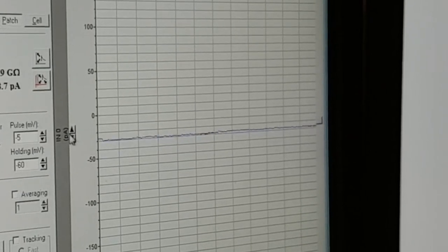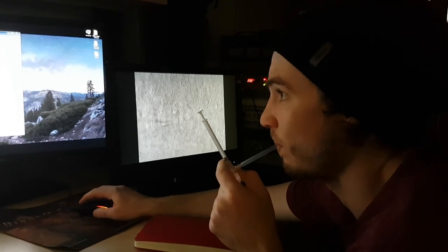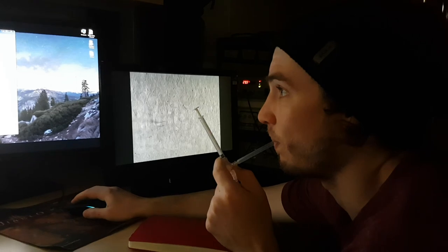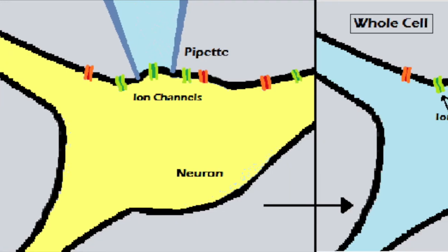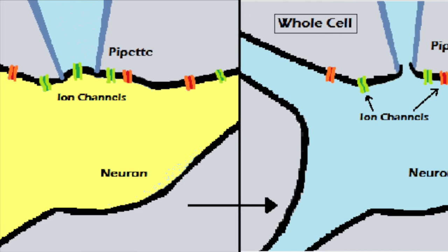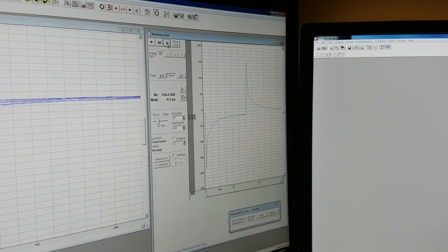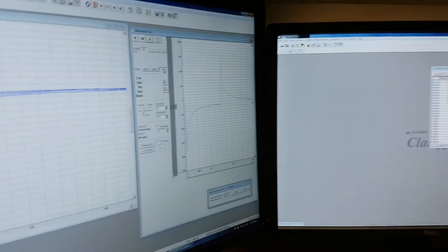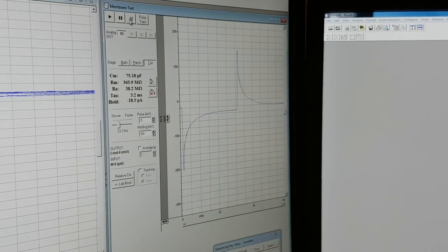Once a stable giga-ohm seal is formed, denoted by the tip resistance being maintained over 1 giga-ohm, we are then ready to perform a whole-cell patch. We then, once again, apply a slight negative pressure to rupture the cell membrane, allowing the glass recording pipette to, therefore, become an extension of the membrane. This is regarded to as the whole-cell patch clamp configuration. It can be noticed that there is a change in current, charging the membrane because of the cell capacitance. Since the membrane of the cell acts as a capacitor, when the glass pipette has gained access to the intracellular space, the current responses to the seal test should show an exponential decay.